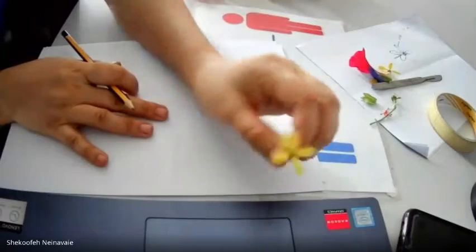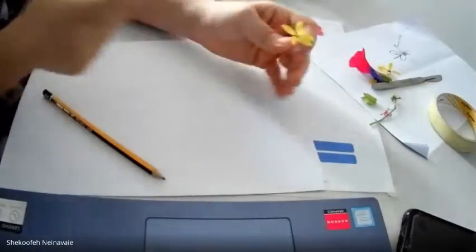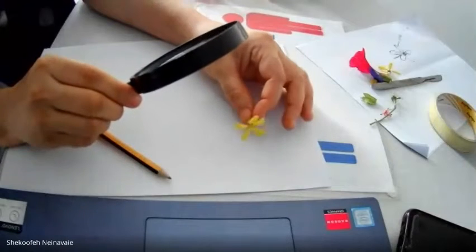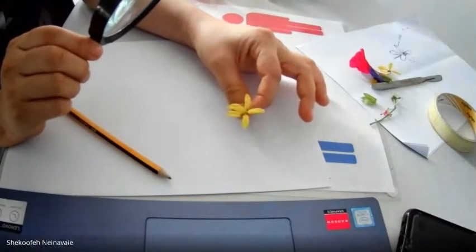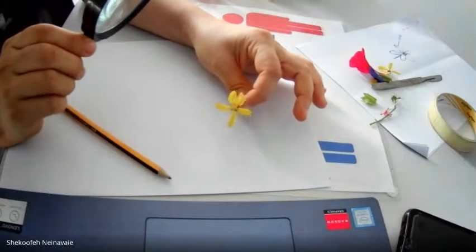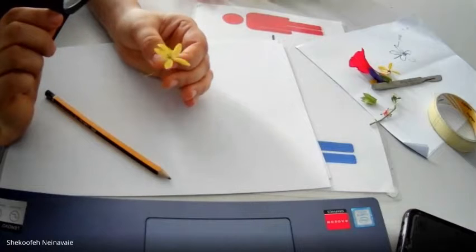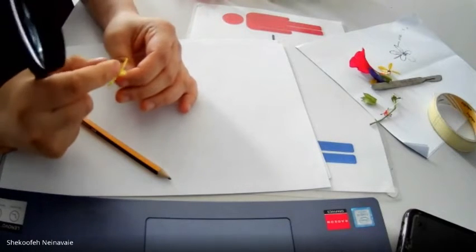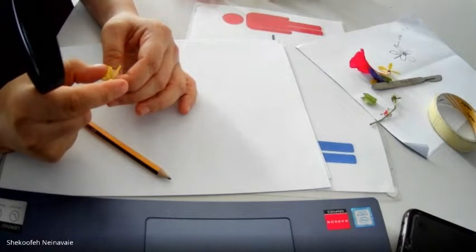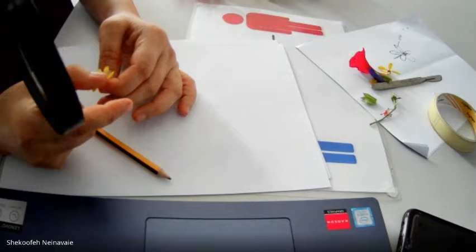Sometimes you may need some special devices. You can use, for example, a magnifying glass to watch the plant from very close. And if the structures are very tiny or small like this, you can fix this somewhere and find the best angle so that you can see all the different parts of these plants. I try to move everything apart here to expose the female part.